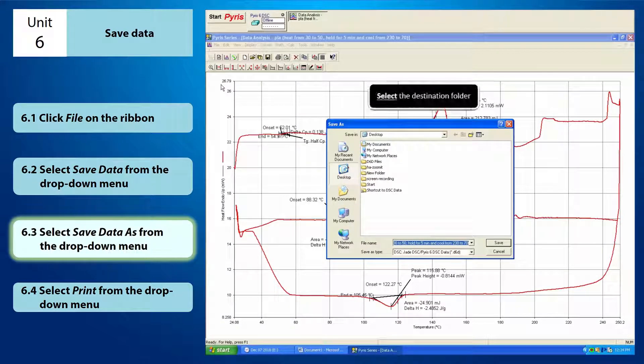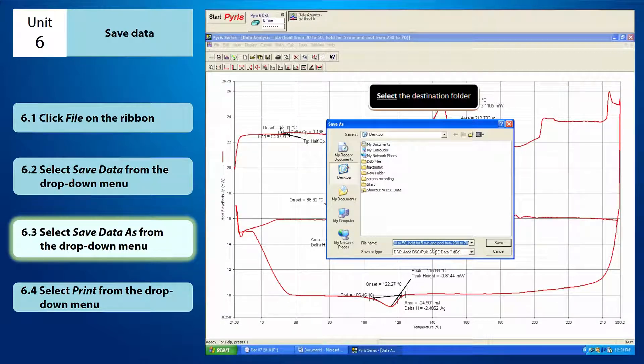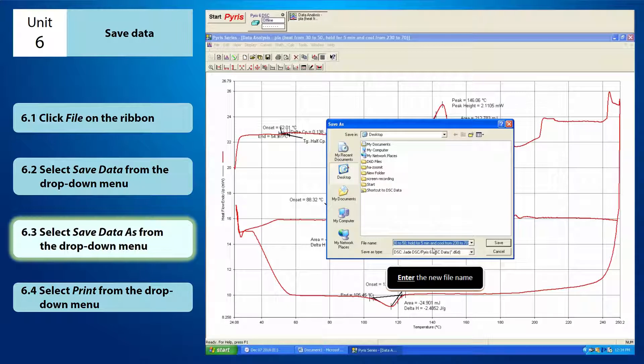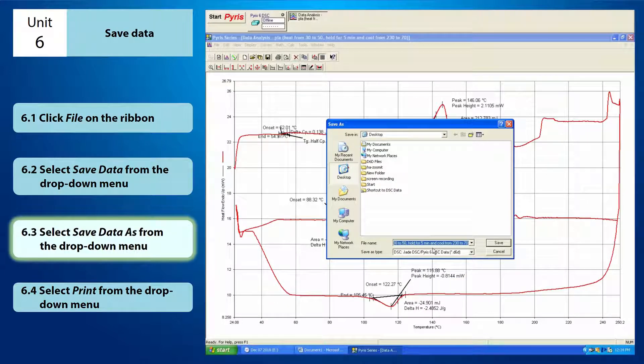Select the destination folder you want to save the new D6D file. While saving your data, you have to enter a new file name so that it won't rewrite the original file data that you wish to keep.